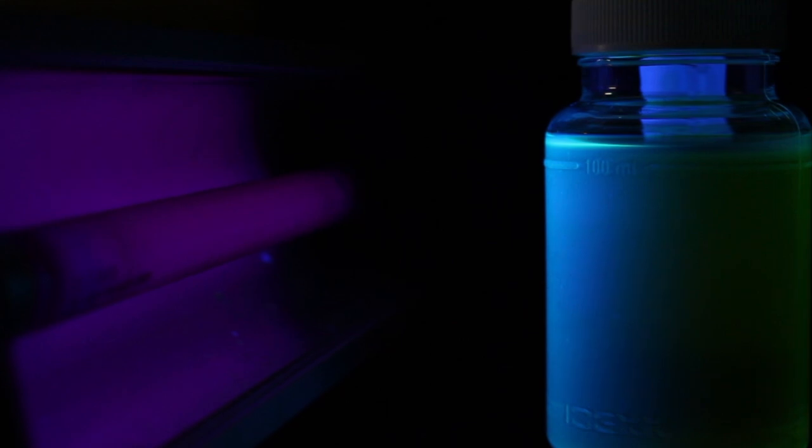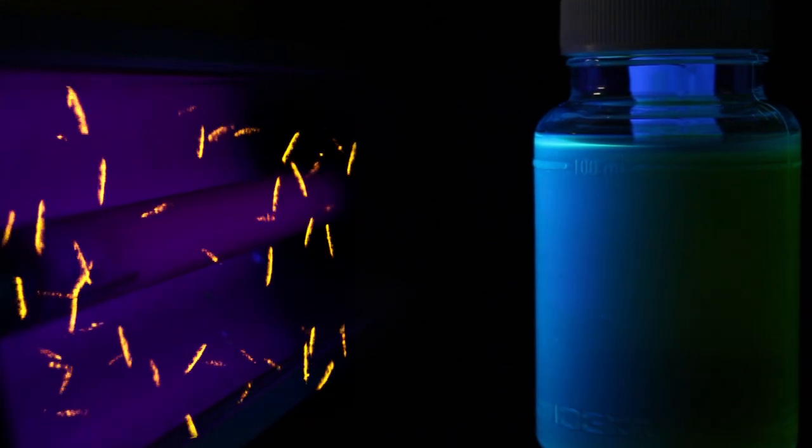In this event, the sample is not only positive for total coliforms, but for the more critical fecal coliforms as well. This could lead to what is called an acute violation of the total coliform rule.